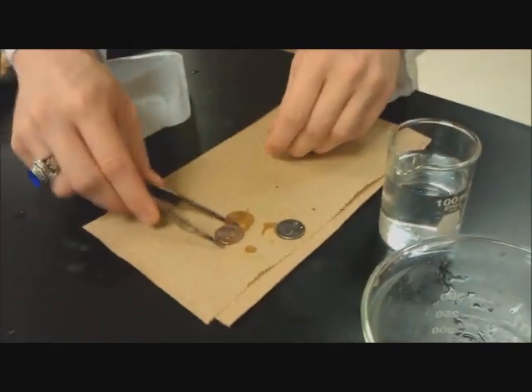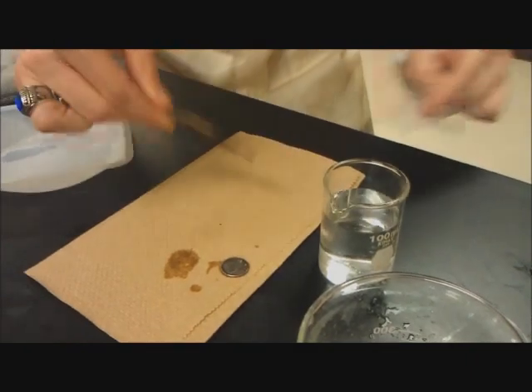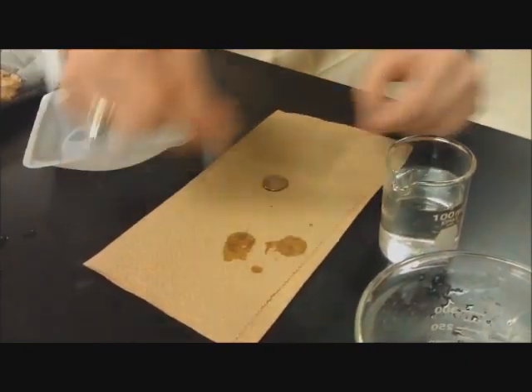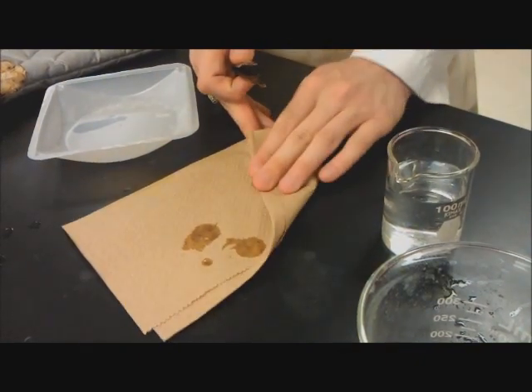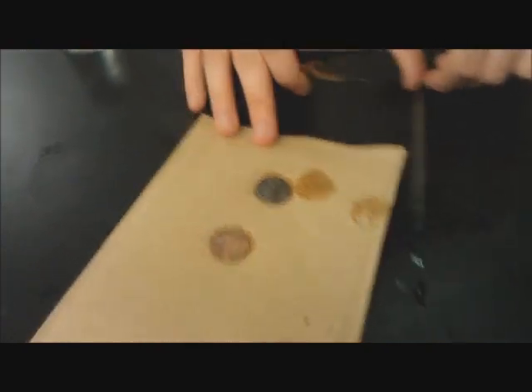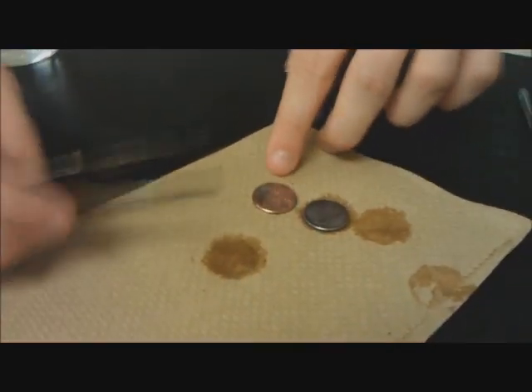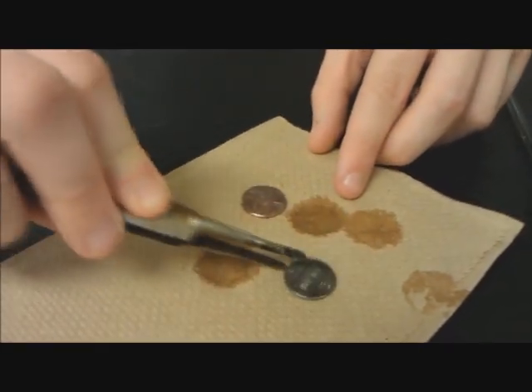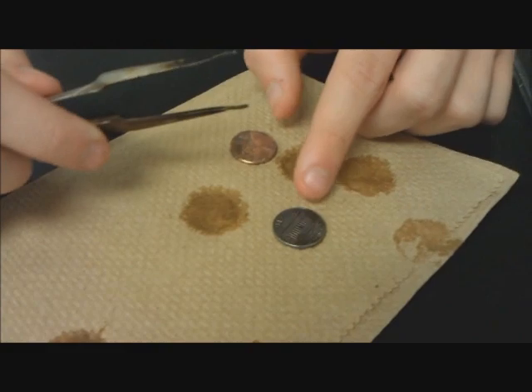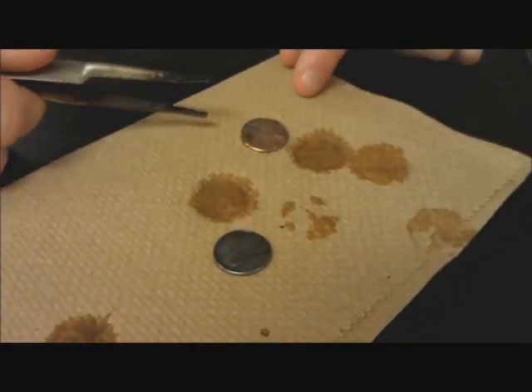Now we're going to go ahead and dip them in water to clean them off from the zinc solution. As you can see, I mentioned earlier that we were working with a post and pre-1982 penny. The 2007 penny still retains the copper color, whereas the 1972 penny has the desired effect of the silver — it's clearly plated with the zinc.